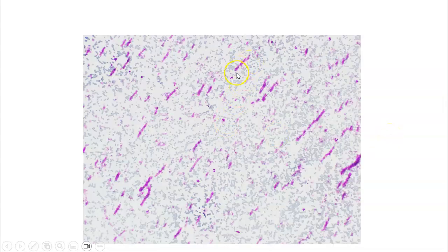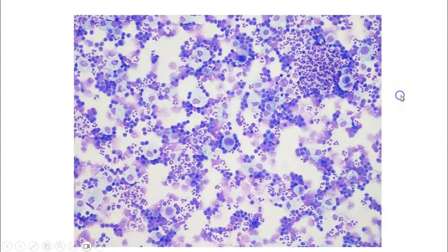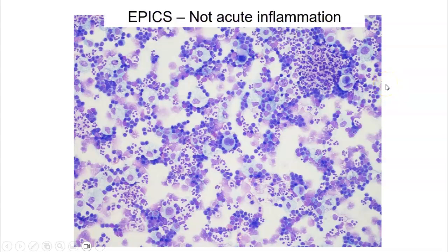Now this is stain residue, so this means that the staining solution has a lot of sediment, and it's stained sediment, and you can also recognize it because it goes beyond the smear onto the rest of the slide. So you need to filter the staining solutions. And this is also an artifact that comes out of Epics processing.